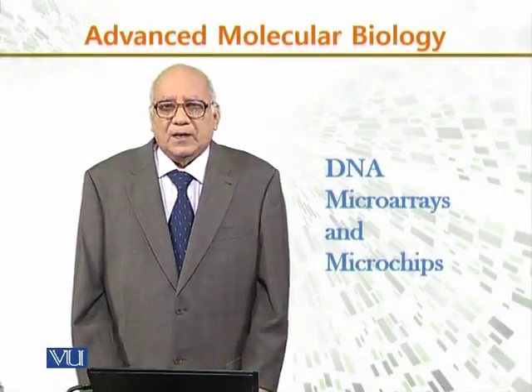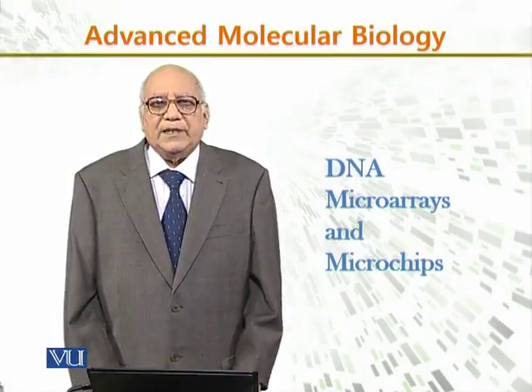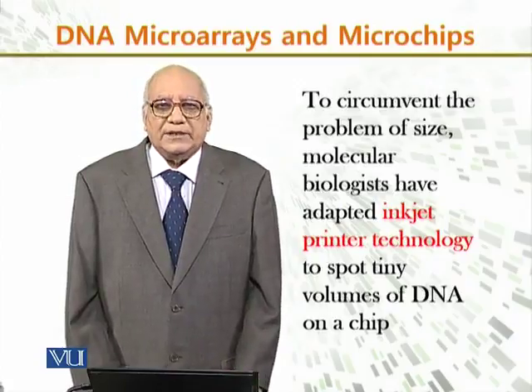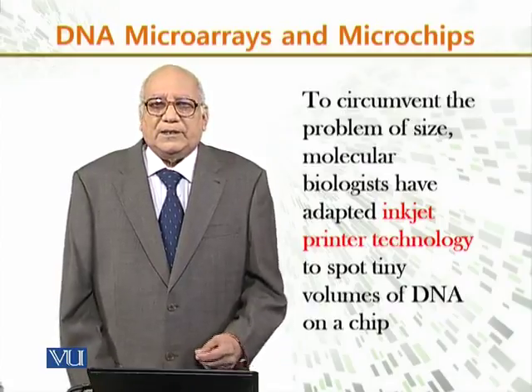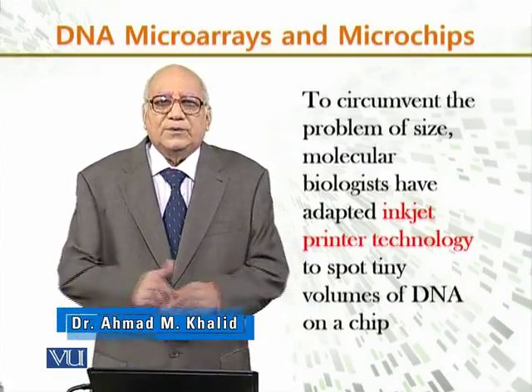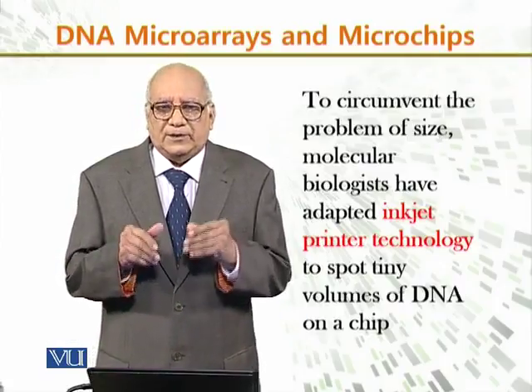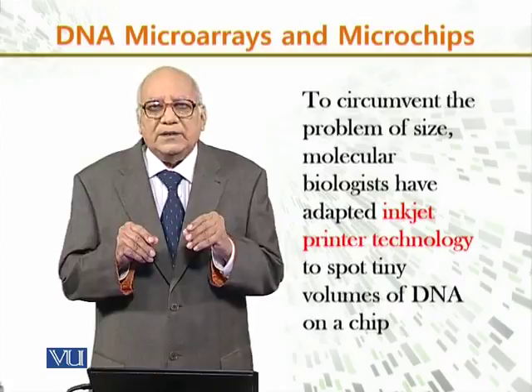In this module, we will discuss DNA microarrays and microchips. This is how molecular biologists tackle the problem of dealing with a large number of DNA sample analyses. In order to overcome this problem, molecular biologists have adopted inkjet printer technology to spot tiny volumes of DNA on a chip.